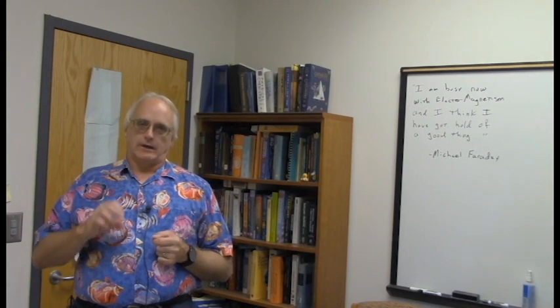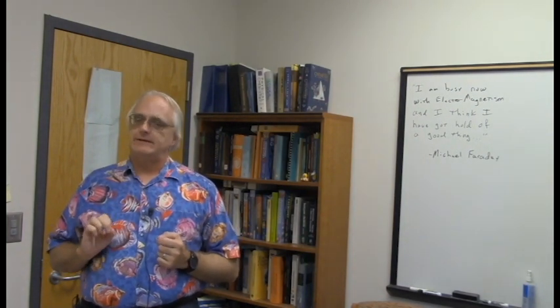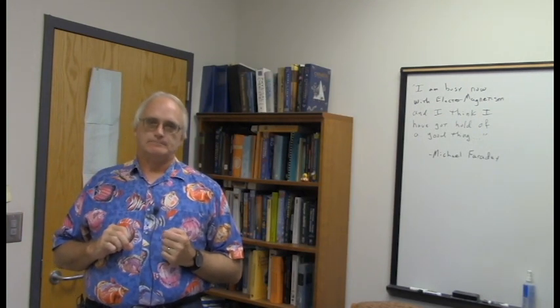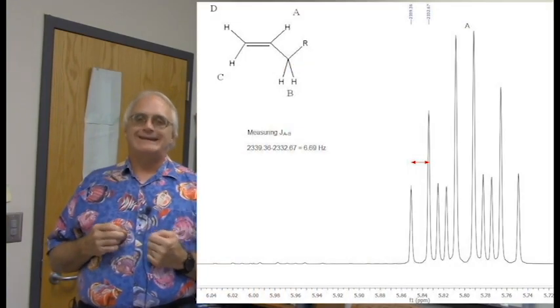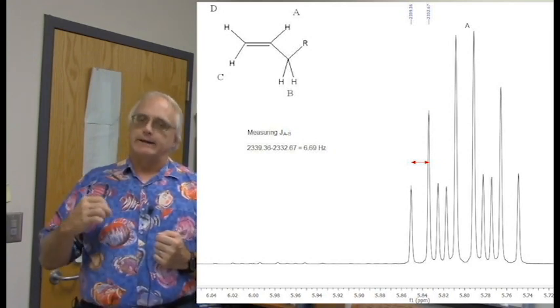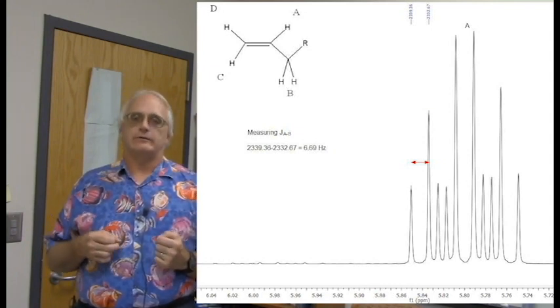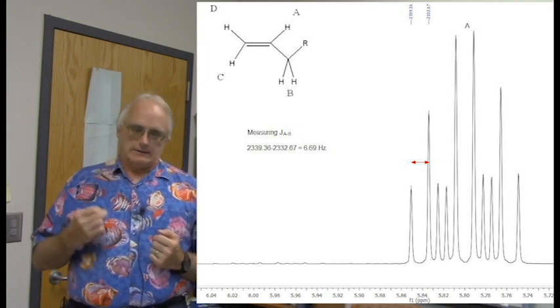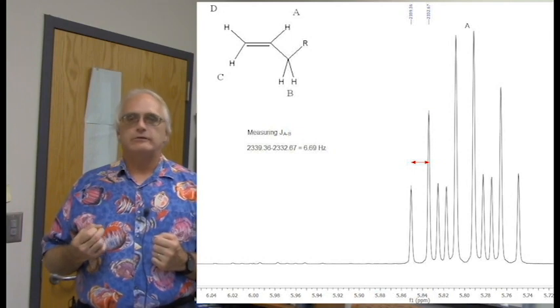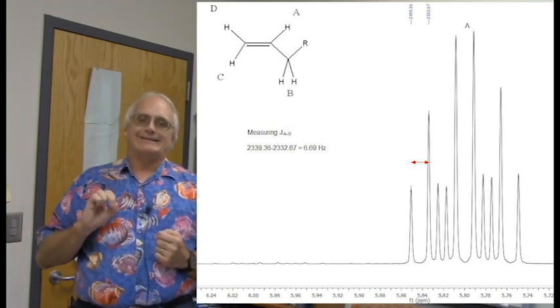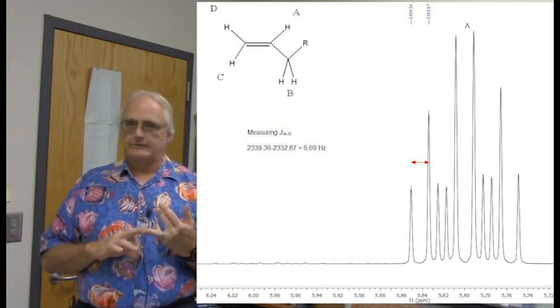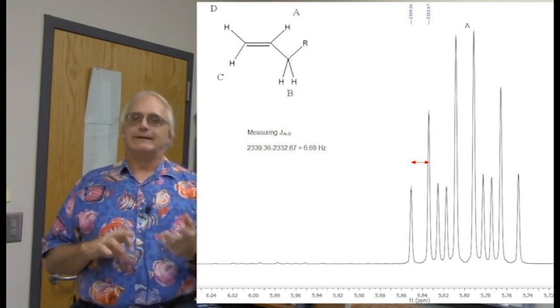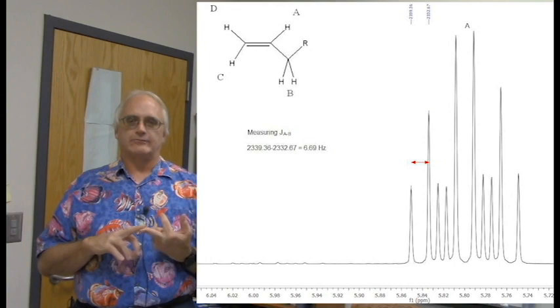And now for the coupling constant between our friend group A and group B, the CH2 group of the upfield side of this molecule. Now to do this, it's going to cause group A to be split into a triplet. And I'm going to go to the resonance of group A, which does have a triplet component in it, and measure the difference between these two peaks here, again in hertz. And I get a value of just under 7 hertz, 6.69 hertz in this case. Classic single bond coupling constant around 7 hertz. Here just a little bit less than 7. And that is going to be our third coupling influence for group A. We have the very large 17 hertz trans coupling, the large but not as large cis coupling from group A to group D, and then the classic aliphatic just under 7 hertz coupling from group A to group B.